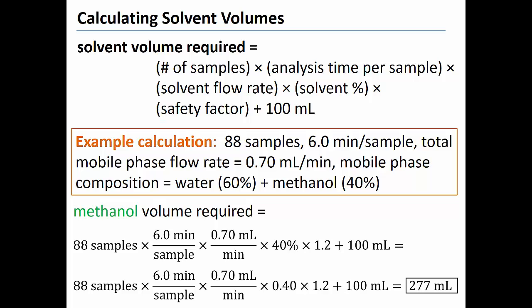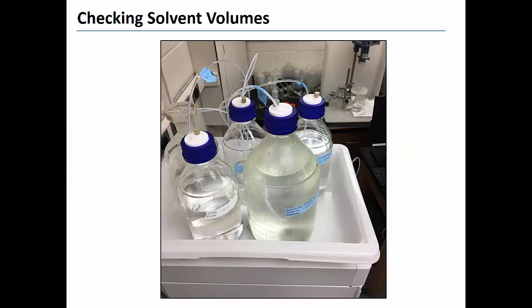Solvent bottles are stored in secondary containers above the HPLC pumps. Quaternary HPLC pumps can draw from up to four solvent bottles simultaneously. Each solvent bottle is connected to tubing that is designated as either line A, B, C, or D. Let's say your method relies on methanol and water. If your HPLC method assumes that methanol is connected to line B and water is connected to line A, make sure that these connections are accurate. Another user might have switched the bottles around prior to you using the instrument.